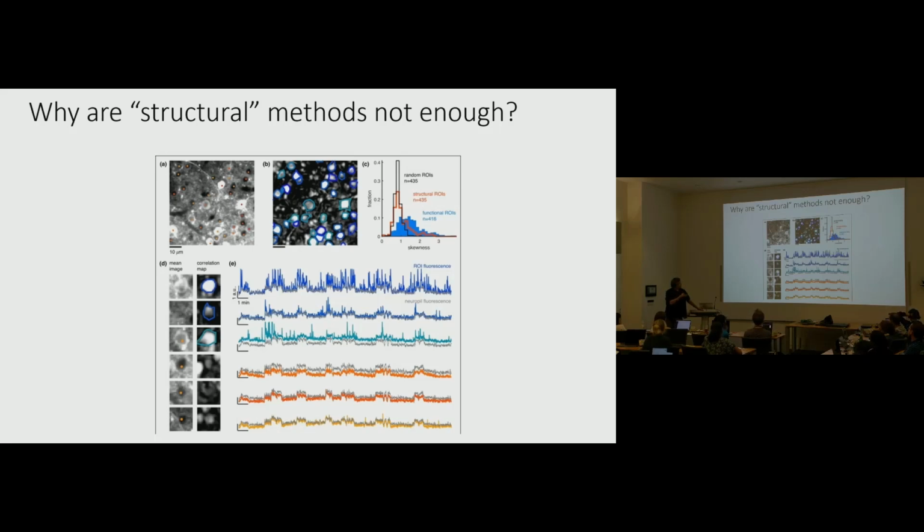And the bigger problem with this approach is described here, where we plot both the neuropil traces and the cell's activity trace at the same time for these different types of ROIs. Neuropil, or background, is simply estimated from a donut around the cell that we identified. We all know that there's some of this background contamination in 2P imaging when we record cells or even smaller things.